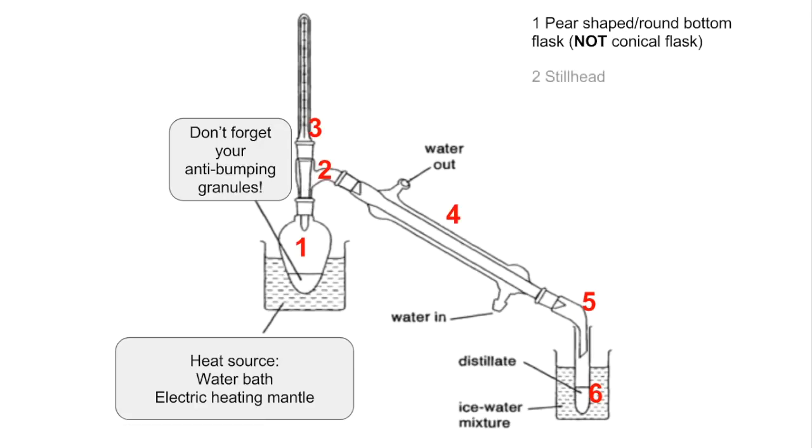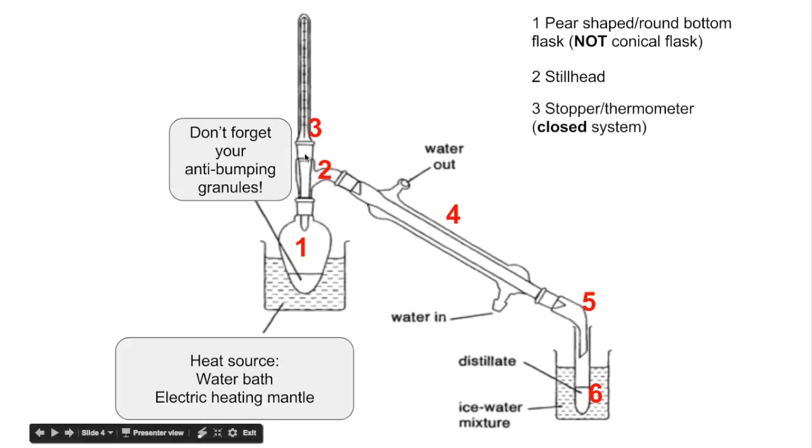Number two is the still head. Number three is a stopper or thermometer — it's essential in distillation that you have a closed system, otherwise the vapour would just escape out of the top. Number four is a Liebig condenser, and water goes in at the bottom and out at the top, so the condenser fully fills with water and you get efficient cooling of the vapour inside the inner glass tube. The condenser is essentially two glass tubes: as your substance is heated and vaporises, it travels down the inner tube, while cold water runs through the outer tube, cooling the vapour and condensing it back into a liquid.